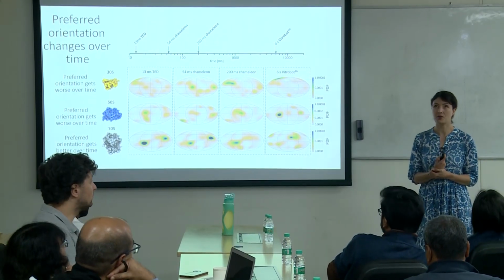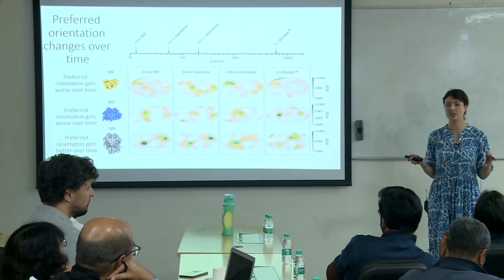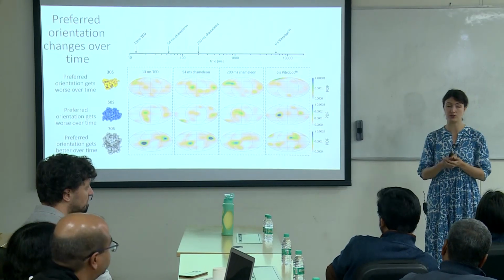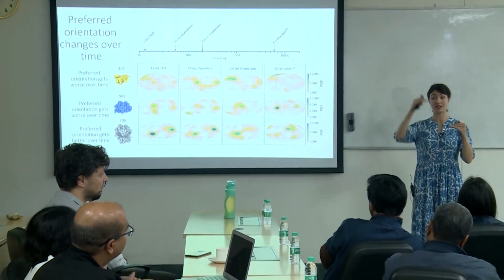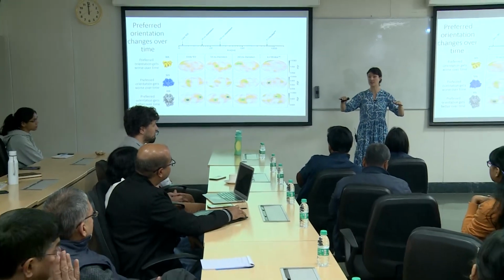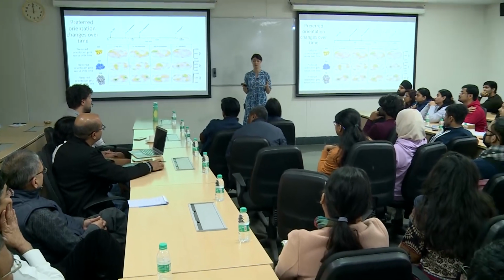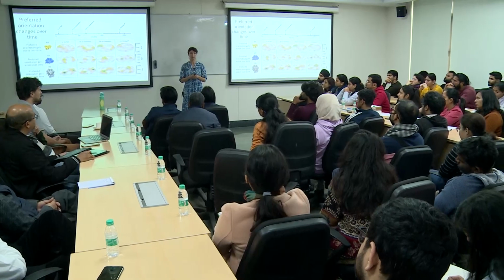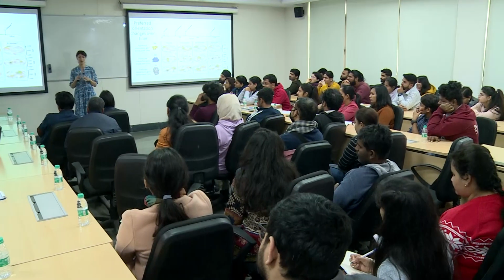So the good news is that there are lots and lots of experimental approaches that you can use if your protein is up at the air-water interface, in order to get rid of that problem. The first one is to sequester your protein away from the air-water interface, so to use a continuous support, graphene oxide or continuous carbon, for example. Another one would be to modify the properties of the air-water interface itself, so adding a surfactant onto your grid, which absolutely works as a strategy, and there are now lots of examples out there.